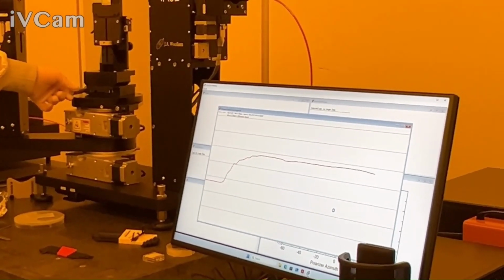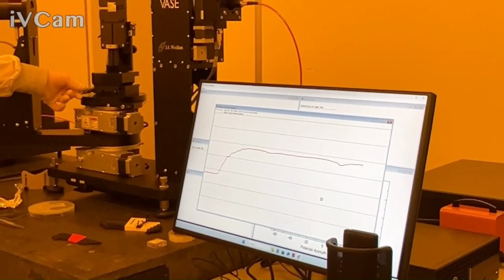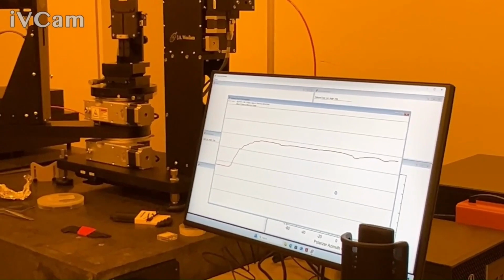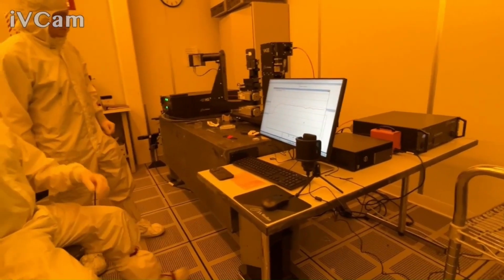So I go a little bit one way until it goes down, and then you just got to get a feel for it. Like here it starts going down, here it starts going down, go back in the middle. If that makes sense. Somewhere in the middle's probably there. Okay, so I'm gonna experiment for a minute. So it's trial and error.